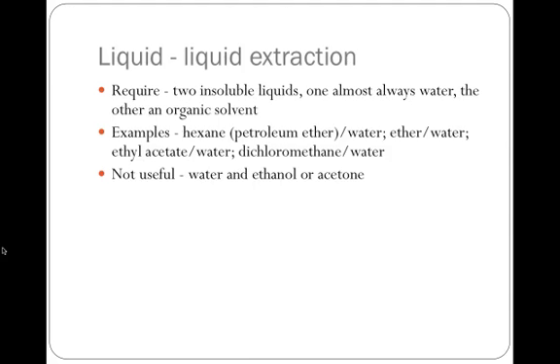A liquid-liquid extraction is usually the first step in a standard organic reaction. What's required to do a liquid-liquid extraction is two insoluble liquids. One of these is almost always water, and the other is going to be an organic solvent. Good examples of a partitioning extraction might be water and hexane.